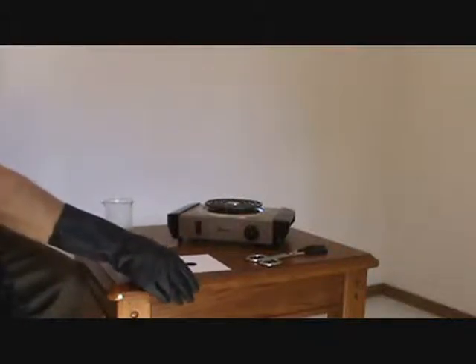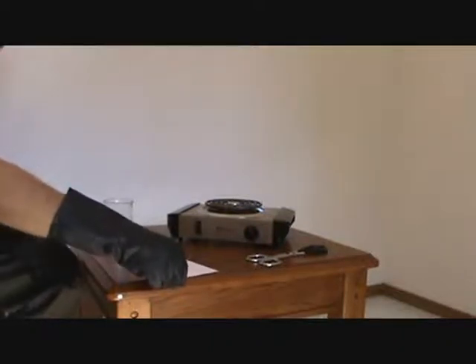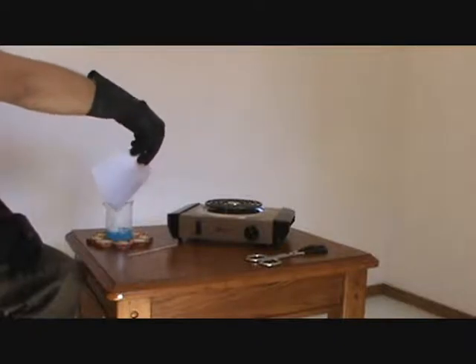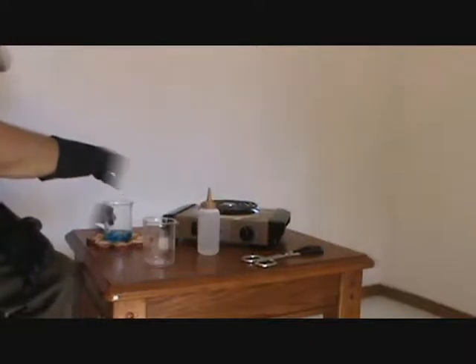I will now add the 1.5 grams of iron filings to the hot copper sulfate solution. I will let the solution sit for 10 minutes to allow it to react, and I will occasionally stir it.